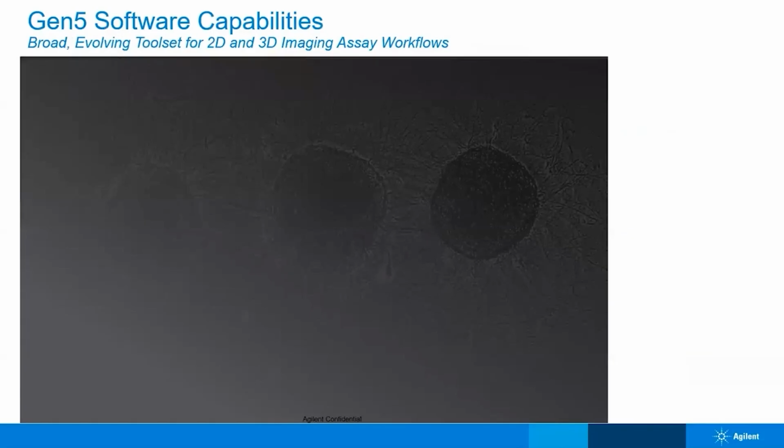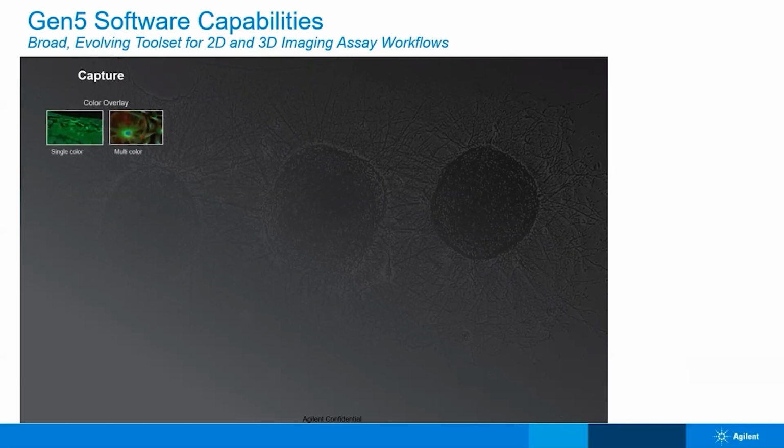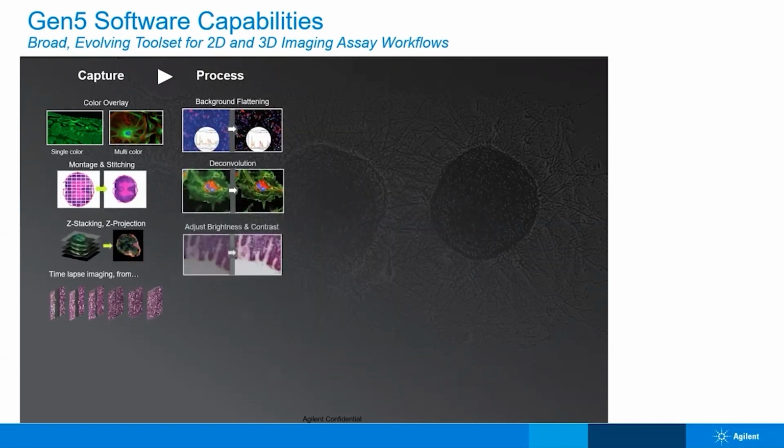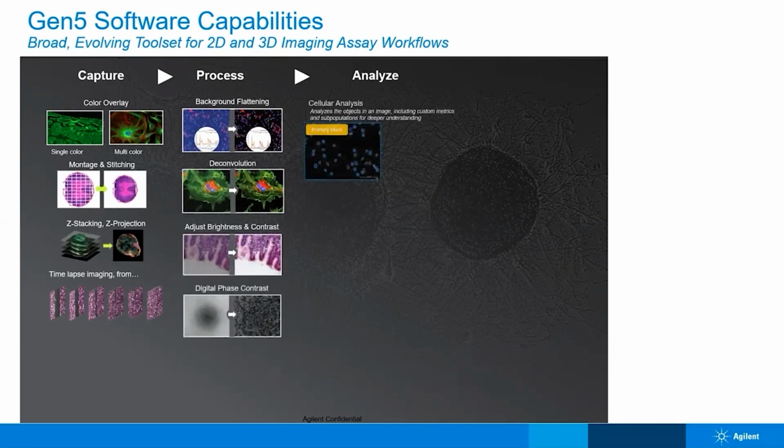I've spent my time focused primarily on image analysis, but I'd like to step back to a higher 30,000-foot view just for a second to really wrap together what I've spoken about, and really when it comes to all of Agilent's imaging platforms. We don't just do one thing in a workflow. We don't just do image analysis or just image acquisition. It really is a holistic view and a holistic workflow.